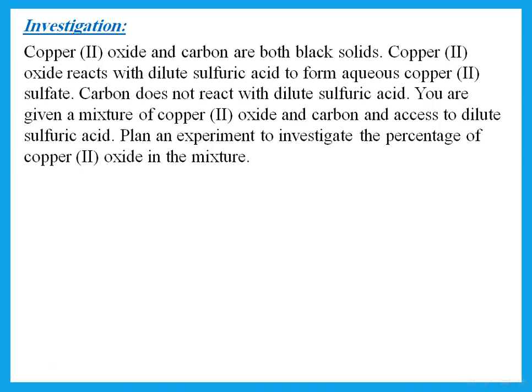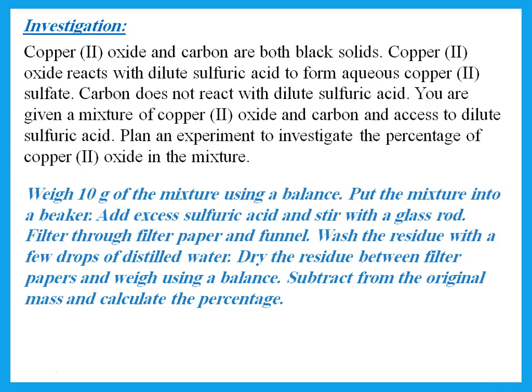So this is basically the same experiment. So I'm going to weigh, of course, 10 grams of the mixture using a balance, put the mixture into a beaker, add acid, stir with a glass rod, filter through filter paper and funnel, wash the residue with a few drops of distilled water. Of course, the residue here now is carbon. Dry the residue between filter papers, weigh using a balance, subtract from the original mass, and calculate the percentage. So this is basically the same experiment as the previous one.